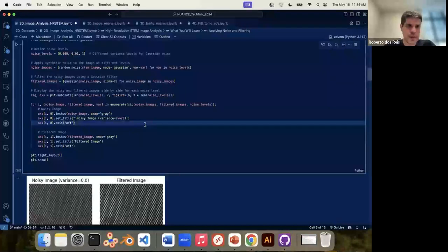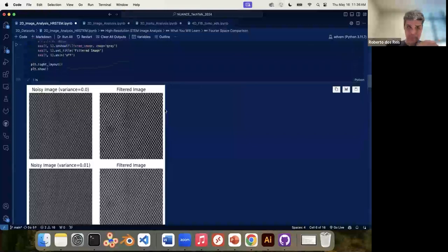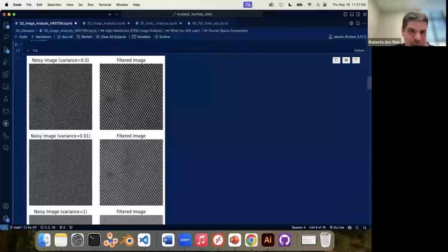And let me show how that looks. I did it for like 3 different examples. So in this case here, no noise, just basically a plain Gaussian filter on the image, which helps, right? As you can see, it helps a little bit already to clear up the image.